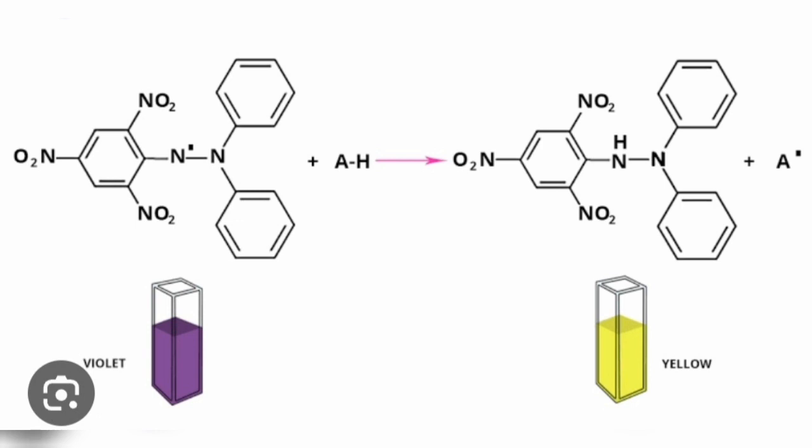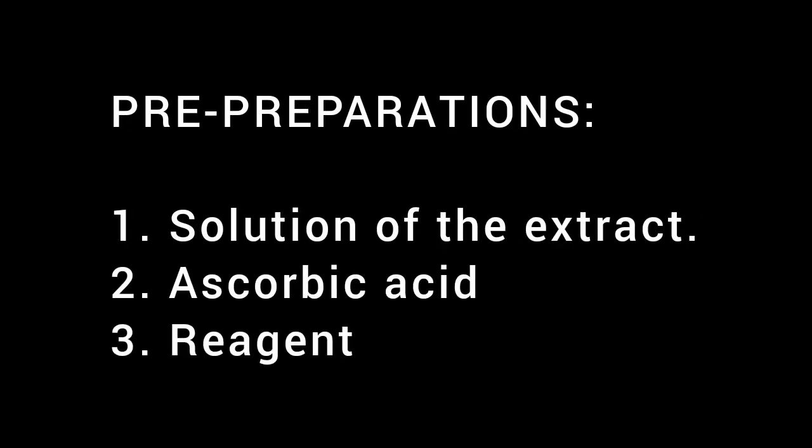The amount of change in color depends on how much electron it has absorbed, and as it changes color, its absorption values will change accordingly. So before properly starting the experiment, there are a couple of things that we need to prepare beforehand.